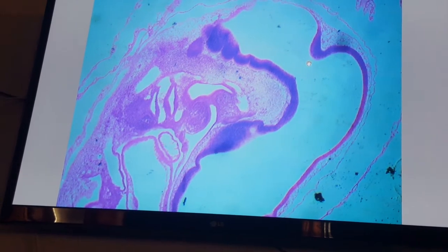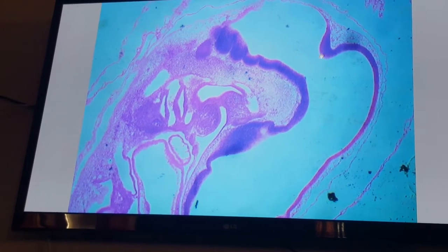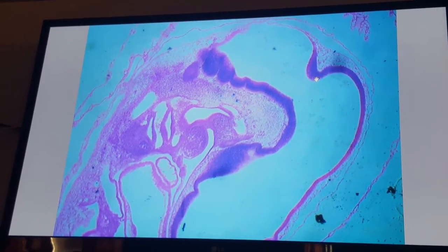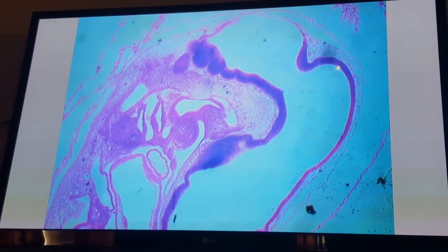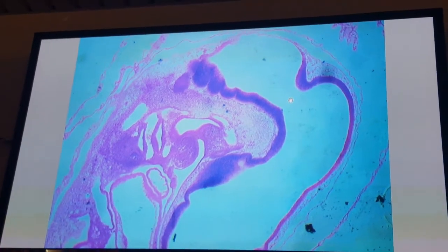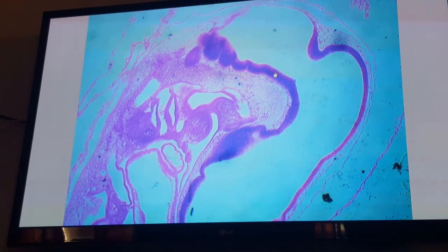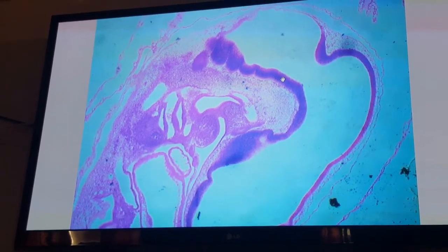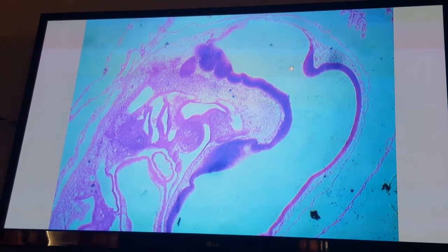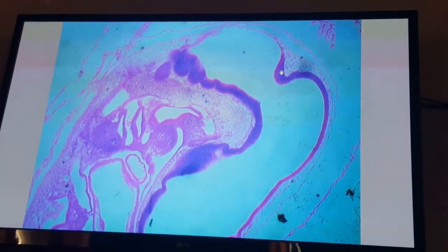Next to the midbrain, you can see another region, which is called rhombencephalic isthmus. This narrow region is called rhombencephalic isthmus. It is located between the mesencephalon and the metencephalon, either dorsally or ventrally. So this is the metencephalon dorsally, and that is the metencephalon ventrally or anteriorly. The metencephalon anteriorly will form the primordium of the pons, while the metencephalon posteriorly will form the primordium of the cerebellum.